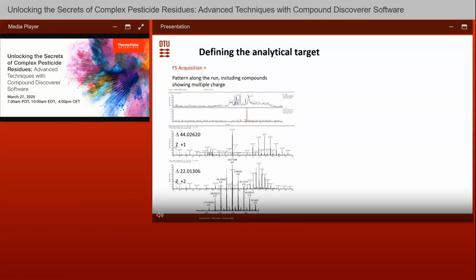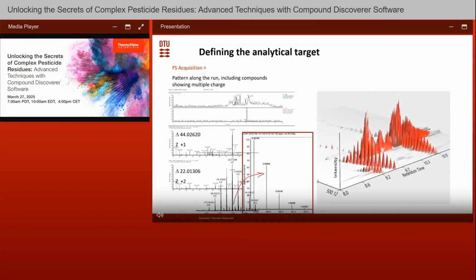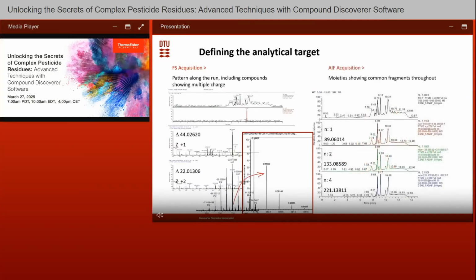We found a particular pattern from the mass spectra. These delta units revealed multiple charge clusters from the isotopic profile, described in the family of compounds where the fragmentation is not specific, leading us to rely solely on the accurate mass.